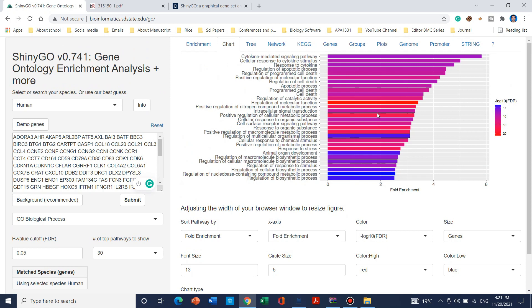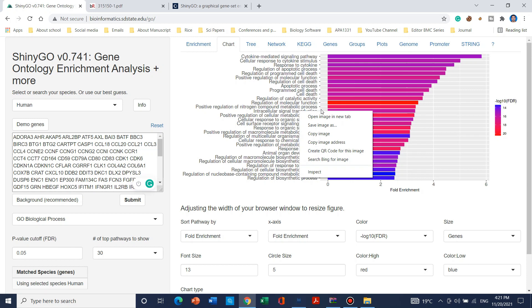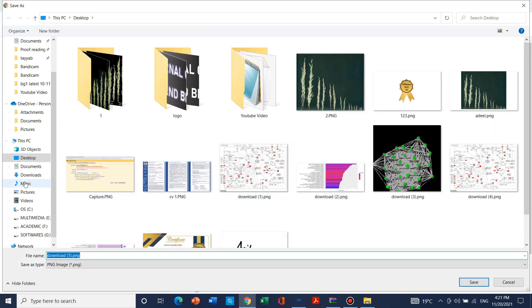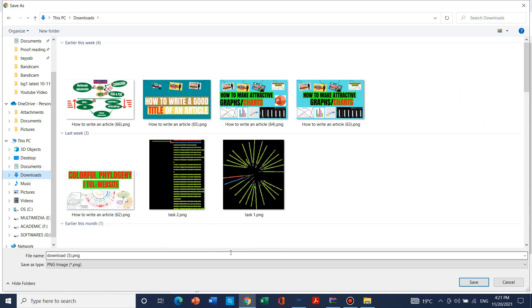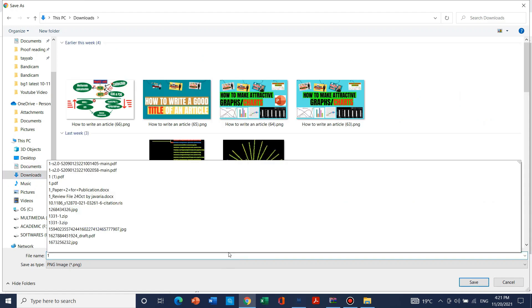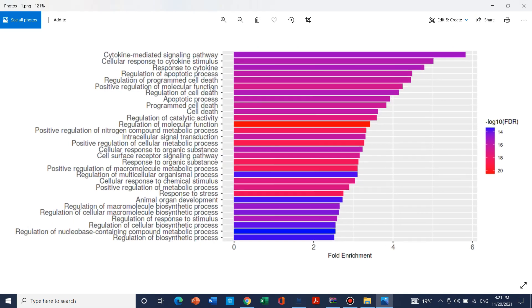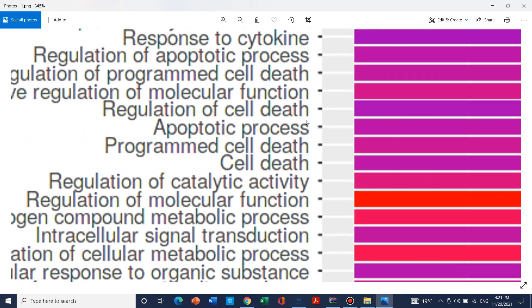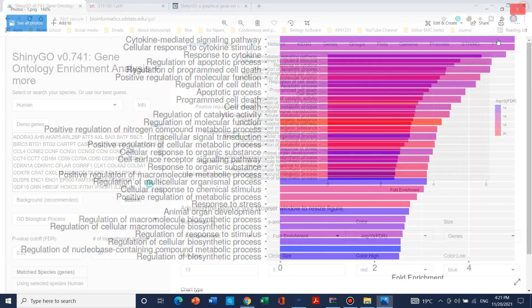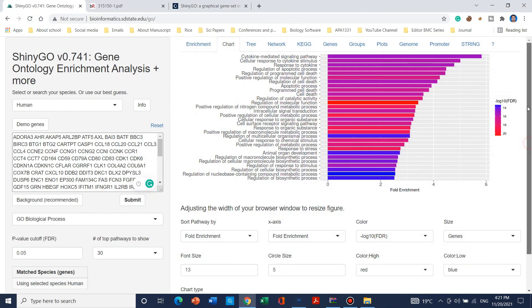If you want to use this website for your publication while doing genome-wide analysis and enrichment analysis, you can simply right-click with the mouse and save the chart as an image. You can download it and click Save. The figure will be downloaded and you can use it for later purposes such as publication or data analysis.